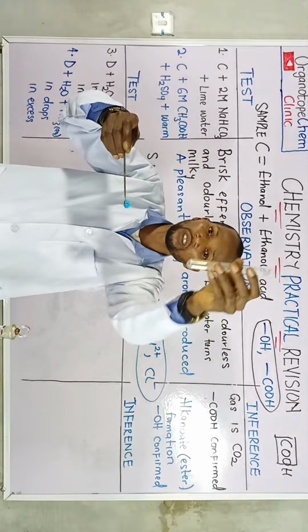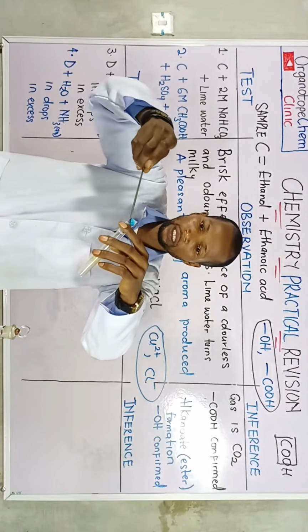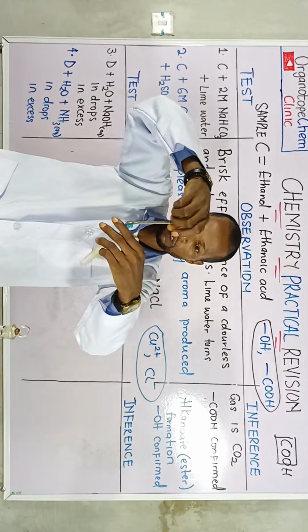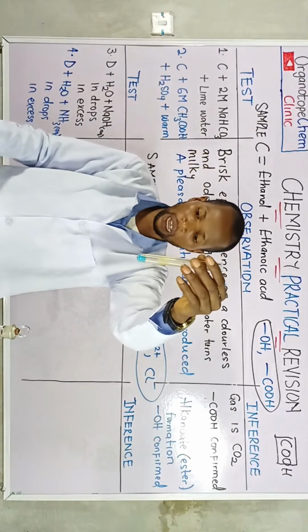I'm going to introduce this into my test tube. I will use this as the boiling tube. Can you see that? So gently into the boiling tube. Okay? So I have it in my test tube now.